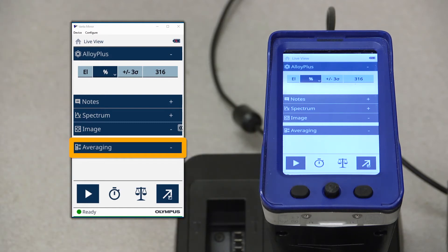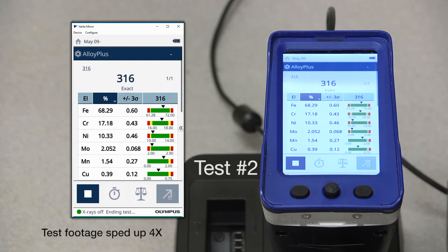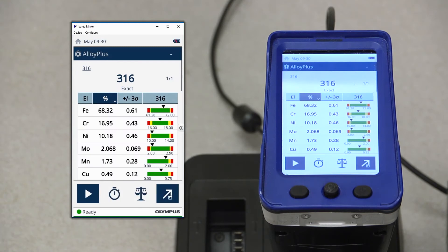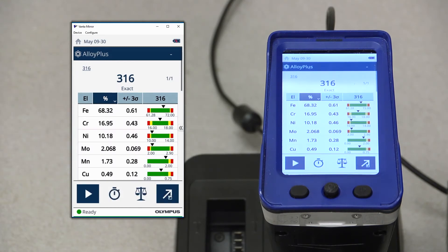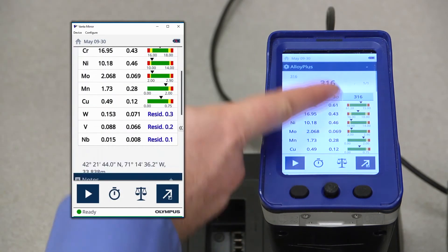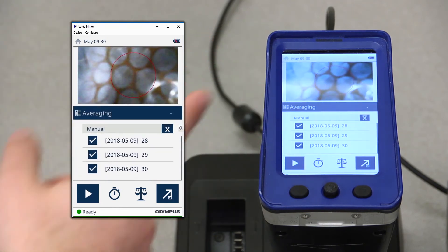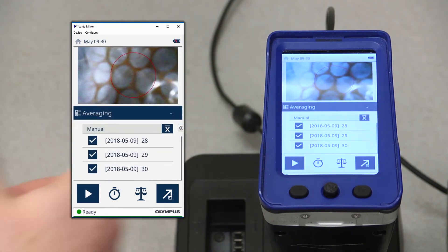Let's take some test results to generate an average. As we generate tests, those results will start to appear in the bottom averaging pane here. The checkboxes next to them will let you select which test results you want to use in generating the average.